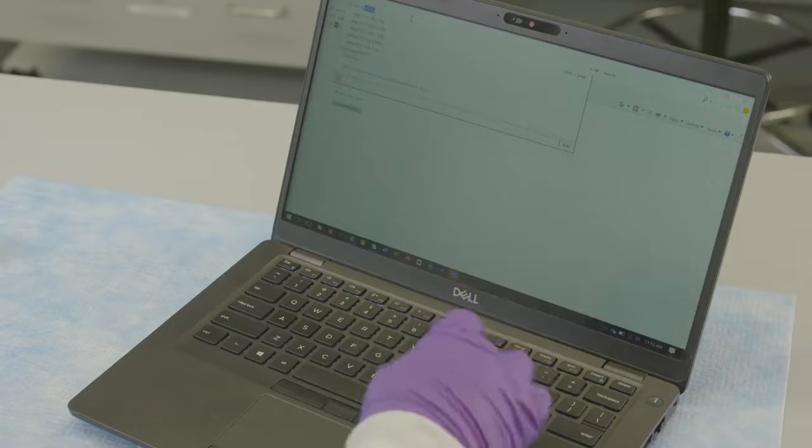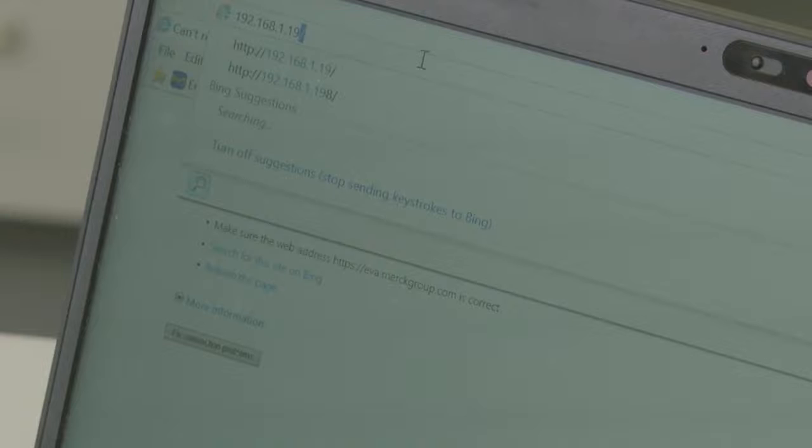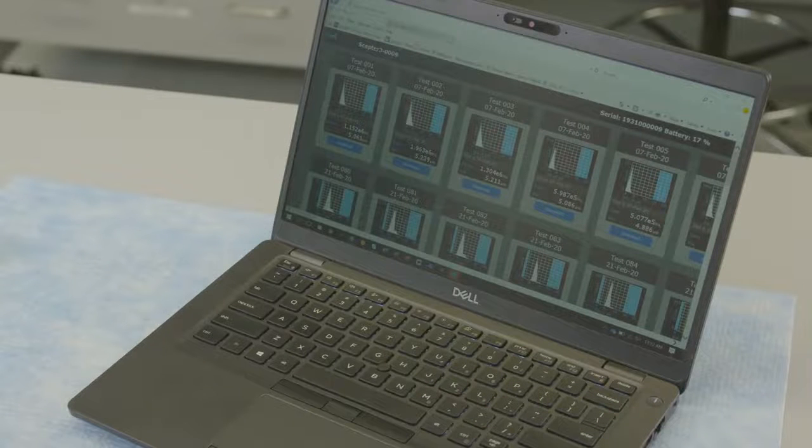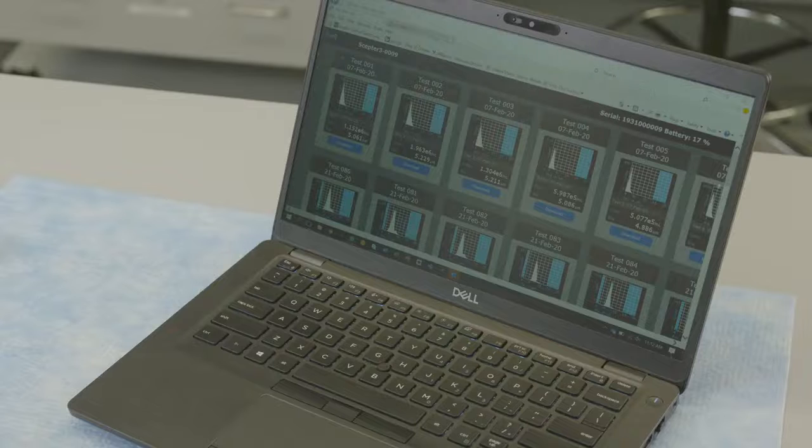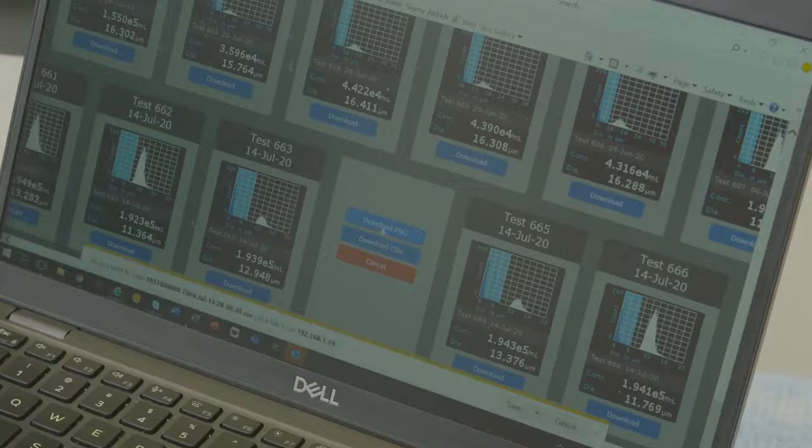From the computer, open the internet browser and type the SEPTOR 3.0 IP address in the address bar and press enter. The current data on the SEPTOR 3.0 instrument will be displayed. Scroll to desired histogram, click to download CSV data and PNG image files to the computer.